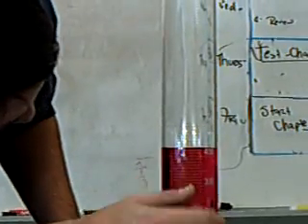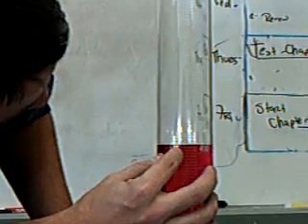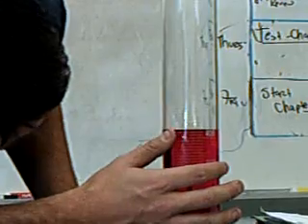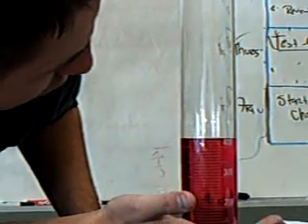When I look down to see where it's at, each of these is 10 milliliters. I look and I go 410, 420, that's just under 430. It's about halfway, so we're going to say about 425.